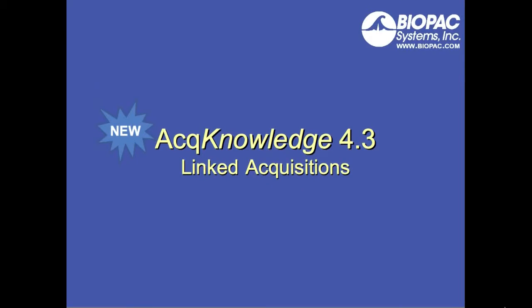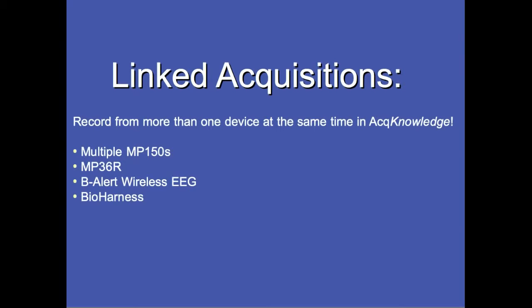This screencast will cover the new feature in Acknowledge 4.3: Linked Acquisitions. Linked Acquisitions allow you to record from more than one device at the same time in Acknowledge. The devices that can be connected for Linked Acquisitions include multiple MP150s, MP36R, BeAlert Wireless EEG, and Bioharness.